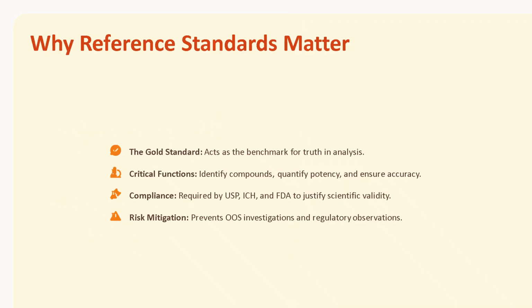Reference standards are often called the gold standard of pharmaceutical analysis. And for a good reason. They serve as the benchmark of truth. Every result we generate is compared against them. They help us identify compounds, quantify drug potency, and ensure analytical accuracy.